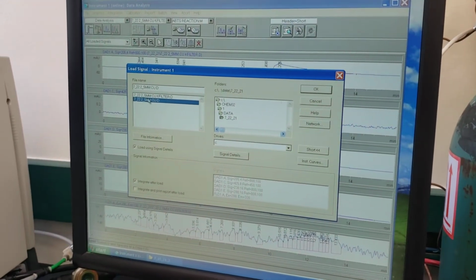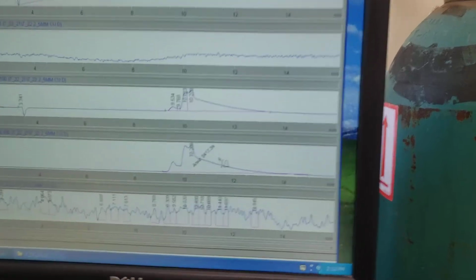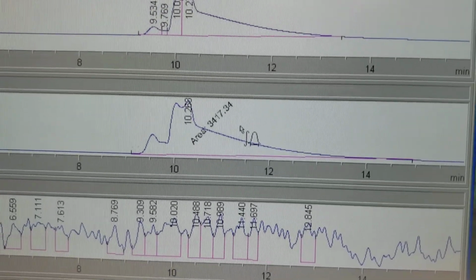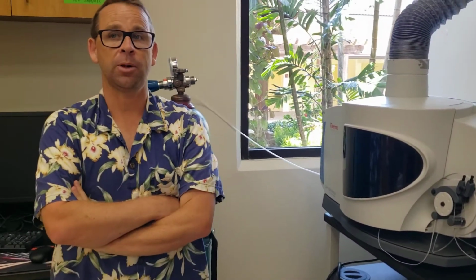Double check here again. 34 to 28. All right, so that's a decrease of copper that got through. But I would think that we might need to allow that activated carbon material to bind more EDTA. But I think it's more likely that the activated carbon in that filter just isn't going to be binding our EDTA really well at all. So we have to get a little creative.